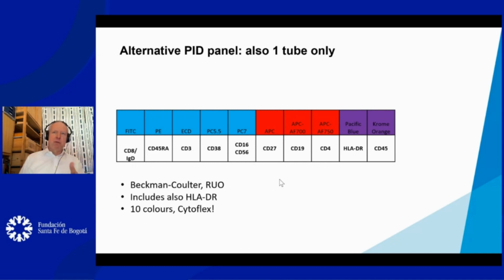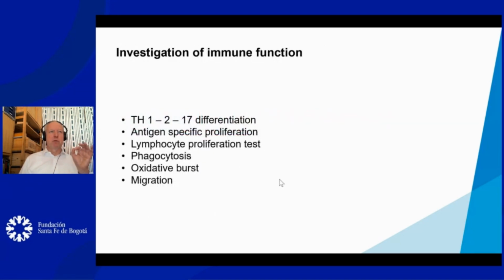Okay, it's not platform independent, but the information you get out of this tube is very, very good and is also very detailed. And the bare lymphocyte syndrome is really an important diagnosis. So this can be covered by this tube. It's better in the information because one very common immunodeficiency is covered, but the problem is you are now bound to flow cytometry from Beckman Coulter.